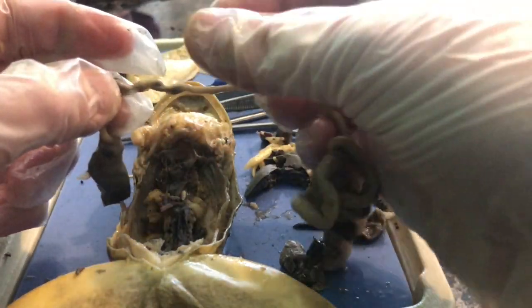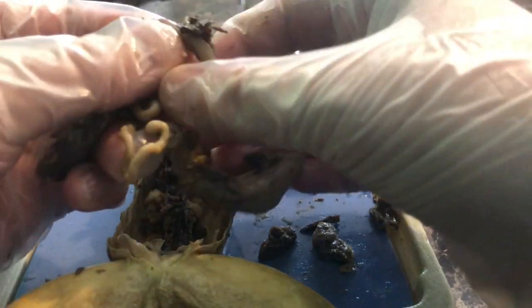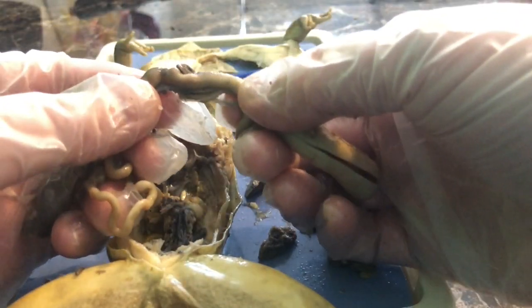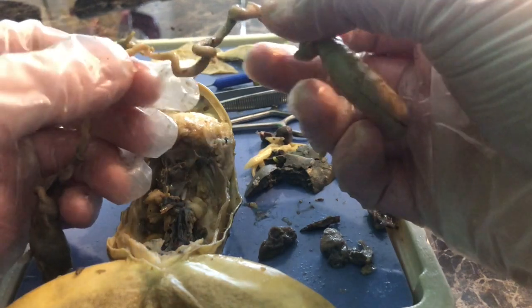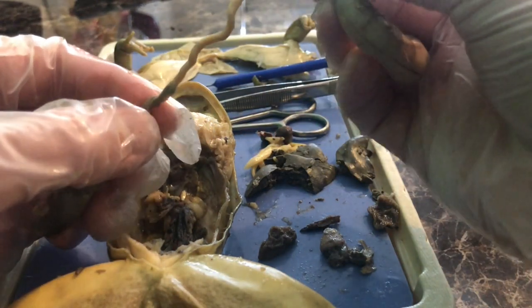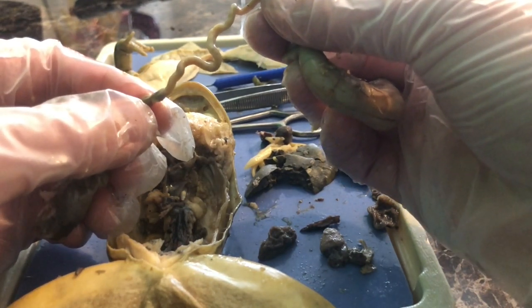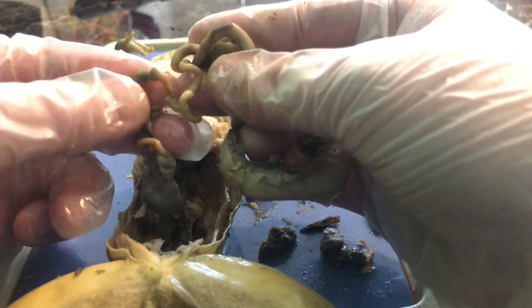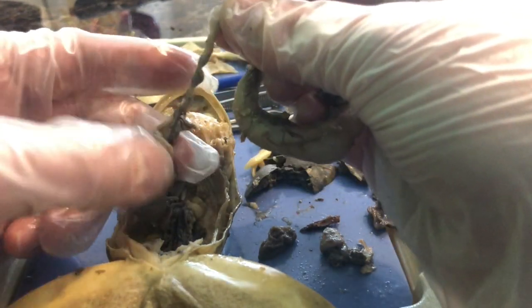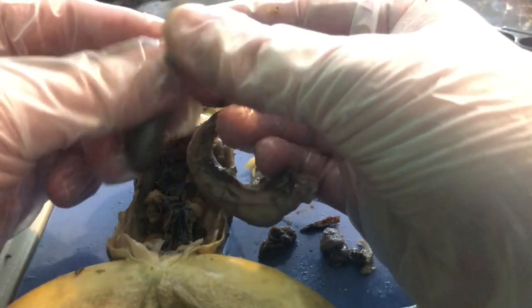Now moving away from the esophagus and stomach, we're going to look at the small intestine. The small intestine leads from the stomach and is very long. The first straight portion of the small intestine is called the duodenum, and then the curled area is called the ileum. There are actually three parts of the small intestine, but we're focusing on two. The ileum and other intestinal organs are held together by the mesentery — m-e-s-e-n-t-e-r-y.